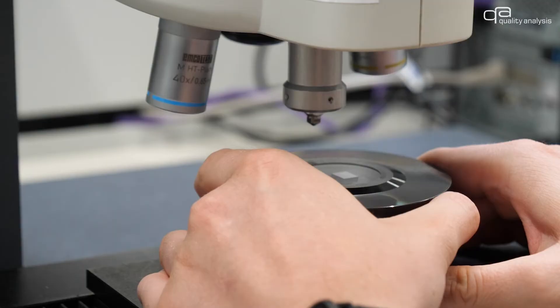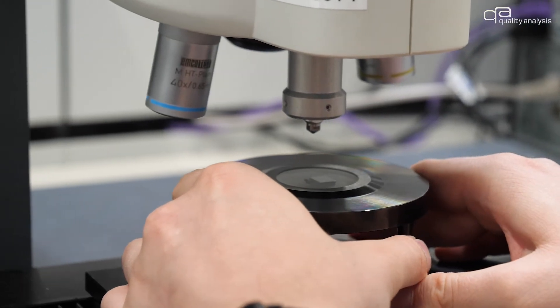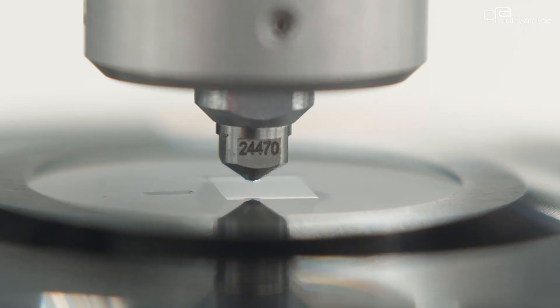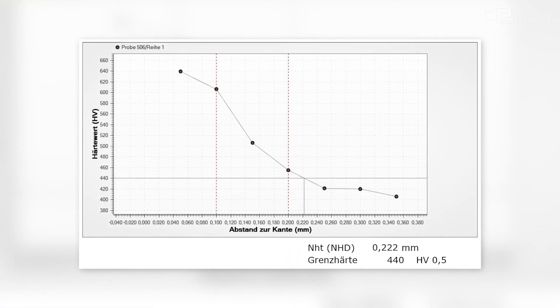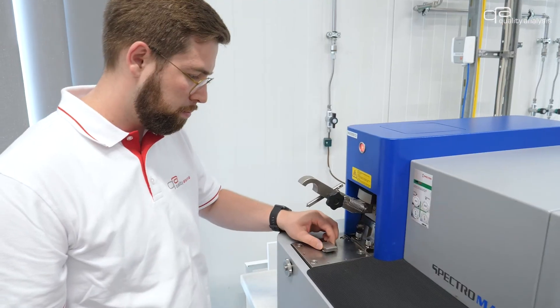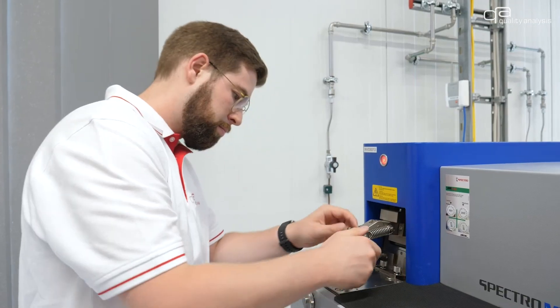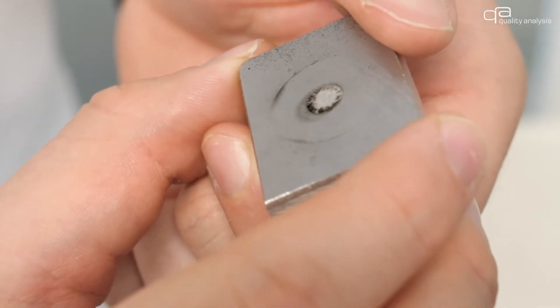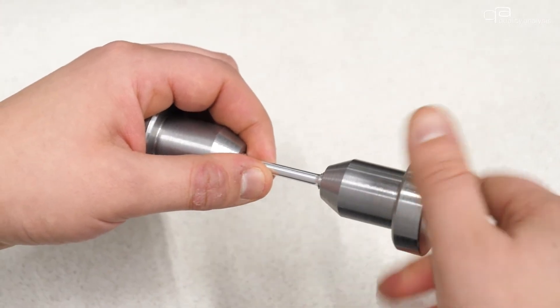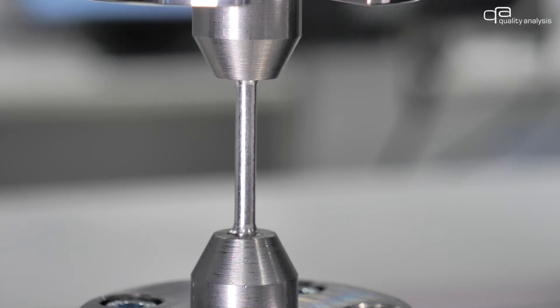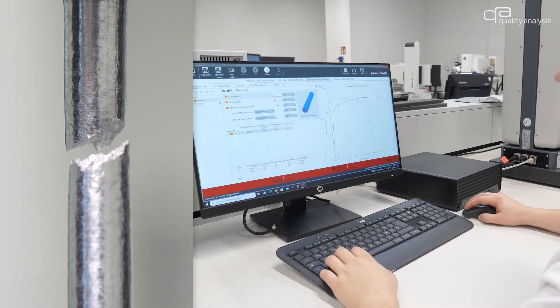Completing our portfolio of services, we also offer hardness testing according to Vickers and Knoop. We check the hardness of a component on its surface or in the core, as well as the heat treatment carried out, in the load range from 0.01 to 10N on the basis of hardness curves. Likewise, we check the chemical alloy composition of all common material groups by means of spark emission spectroscopy, and most recently also the physical characteristics of a material or component by means of tensile, compression, and bending testing up to 10kN, with a wide range of testing applications.